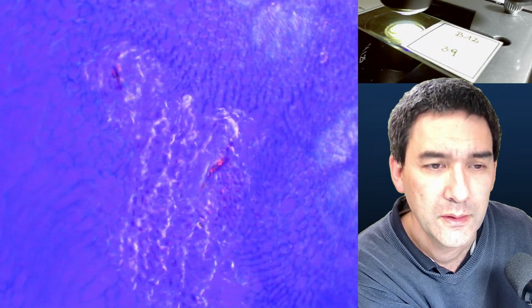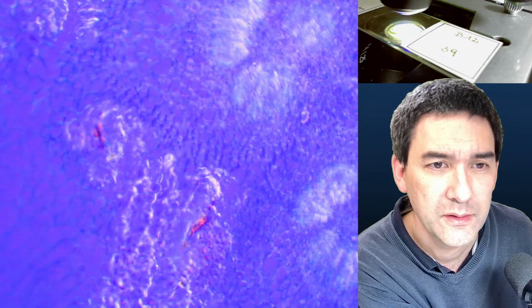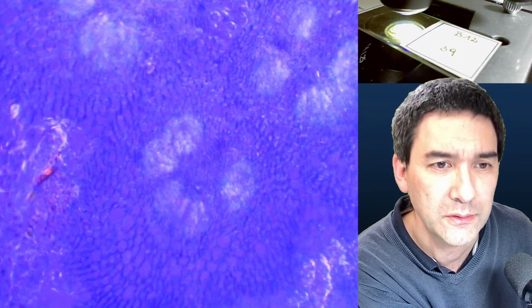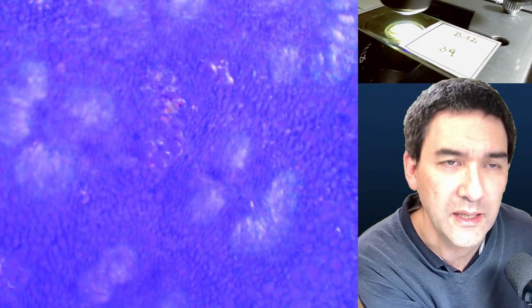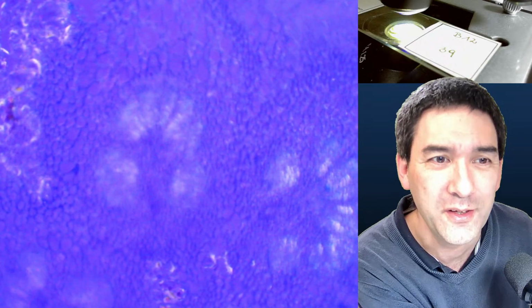But if you add the filter now, and you have to go up, you see that some of the cells start to light up a little bit. And some cells start to become brighter earlier than others, and these seem to be so-called sclereids, in German Steinzellen. And these are cells that have a very thick cell wall, and if you eat a pear, then it sometimes has this gritty feeling in your teeth, like you're biting on something hard. These are those cells here.